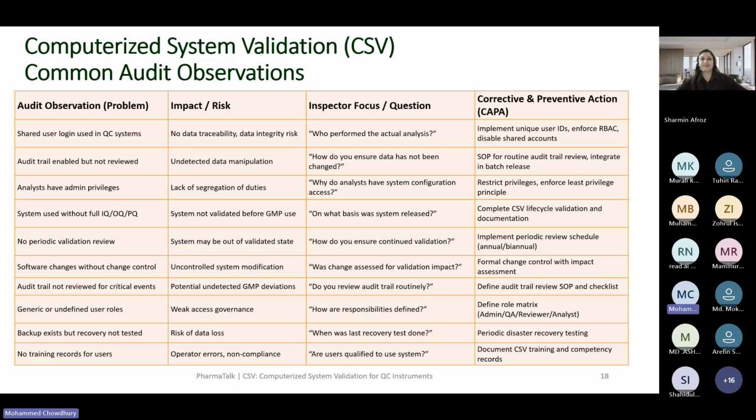And then the next deliverable you presented is the validation report, which is actually the validation summary report. Through the summary report, we can conclude all the deliverables are completed, successful or not successful. If there are any deviations, they also need to be covered in this validation summary report.